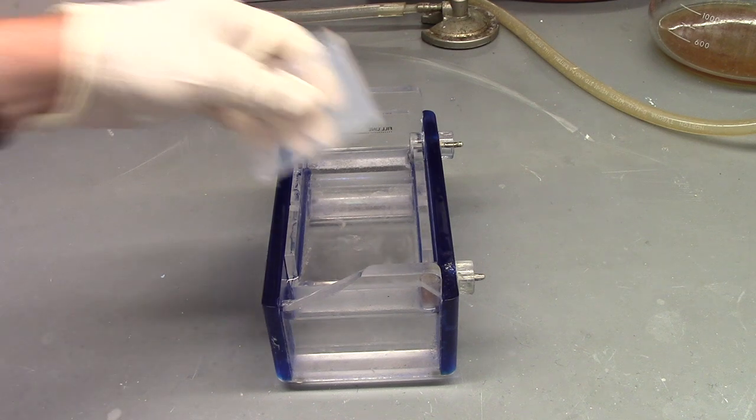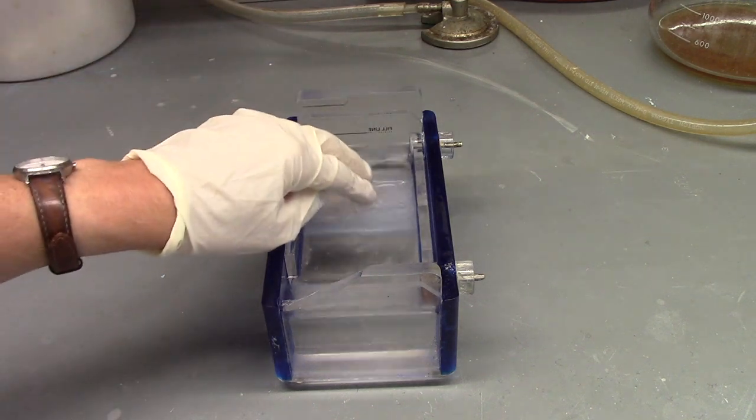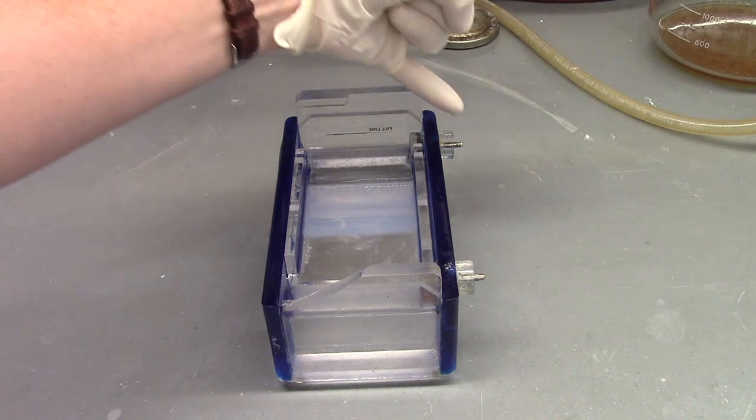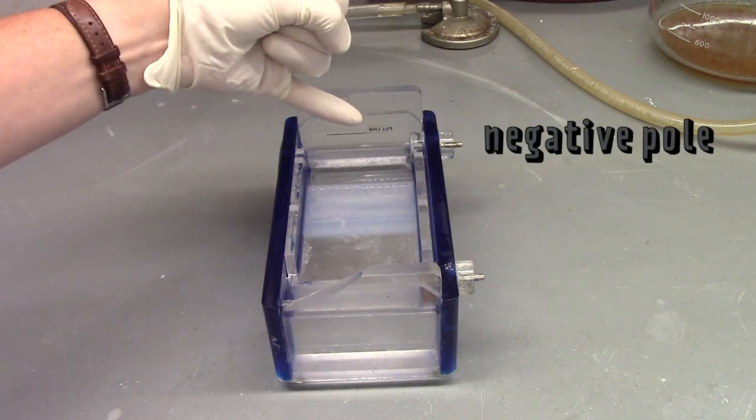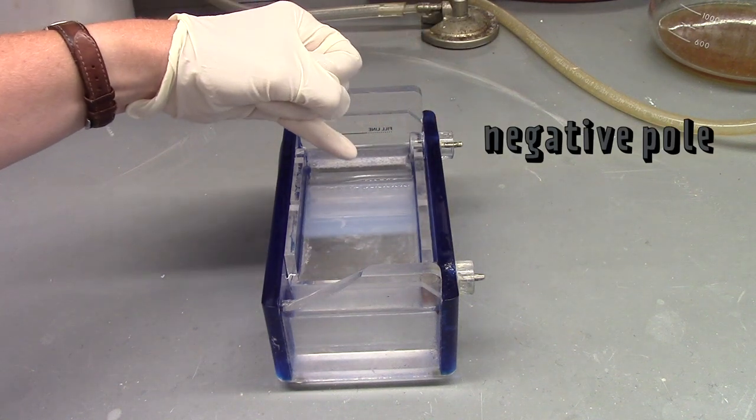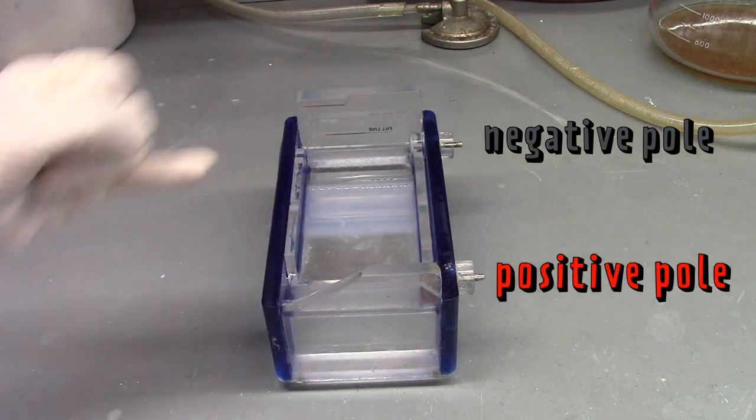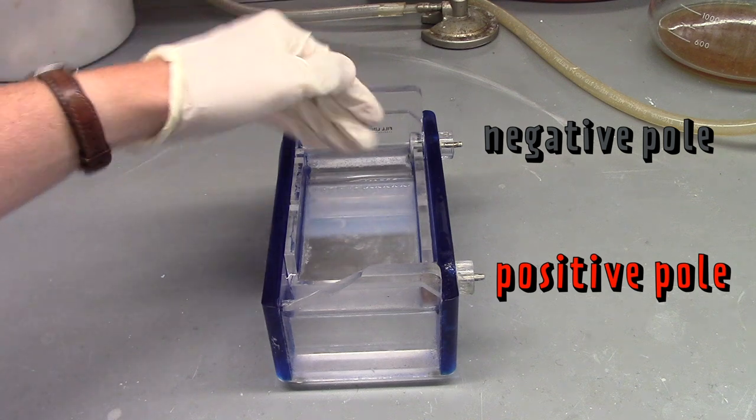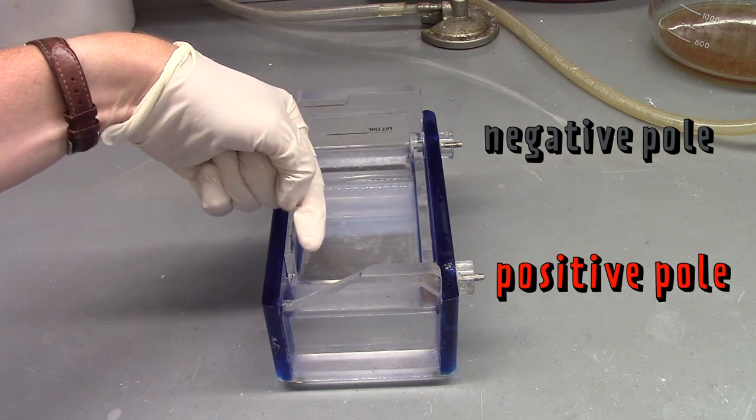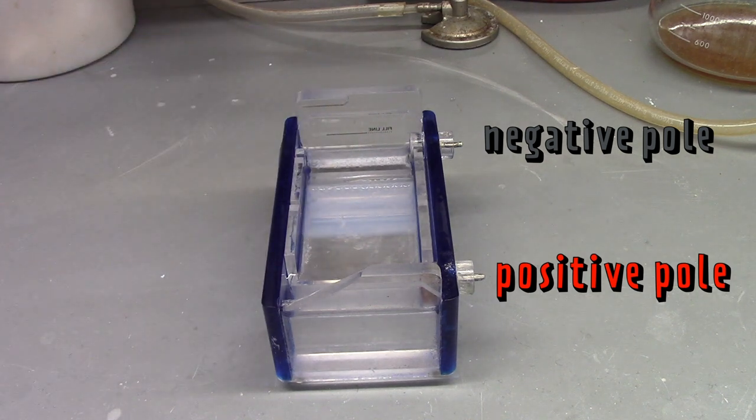To use the electric current, I put the gel in this gel rig, which is full of buffer. And then I apply electricity, and the electricity comes in from the negative pole here. And it runs through the buffer, through the gel, to the positive pole. And the DNA is negatively charged, so it's going to run from up here to down here in the gel. And that's going to help me separate the DNA by size.